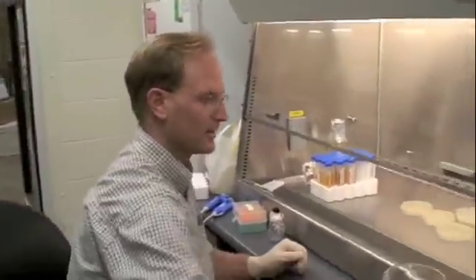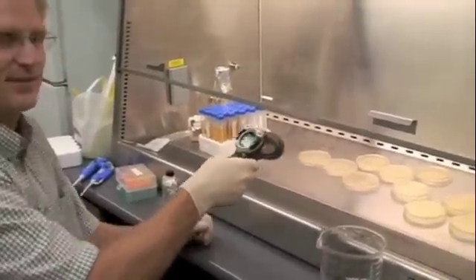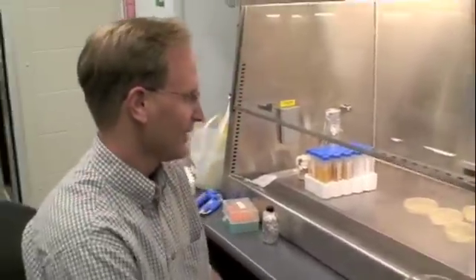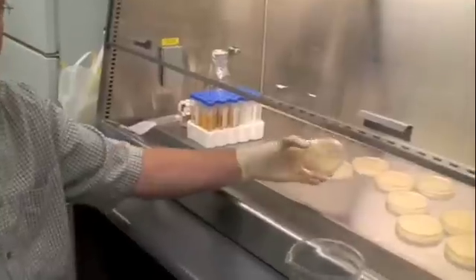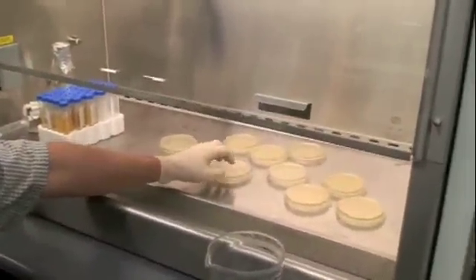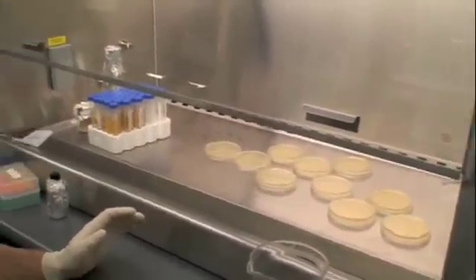So now we need to get our plates ready for transformation. We can check the temperature of our plates — I knew they would be at room temperature, it's just fun to use the gun. But they should be at room temperature by now and cooled. You can tell that they've completely hardened from when we poured them. Again, they're upside down, and I haven't labeled them yet — I'll generally do that after I've got them prepared.